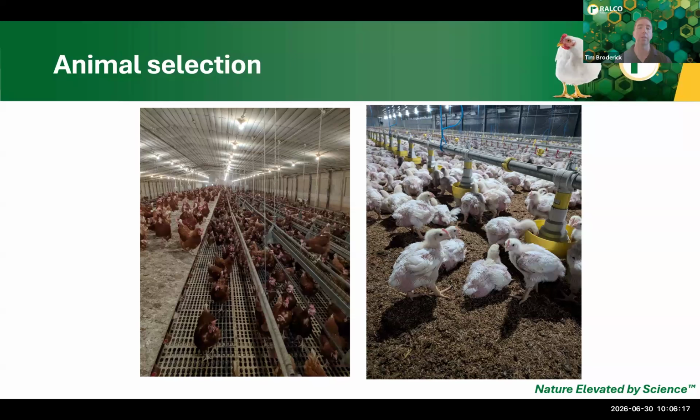First, we want to make sure that we get an appropriate sample, which is a fairly small sample size in all things considered within poultry operations. And it does depend on whether or not you're looking for a specific disease challenge or just doing maintenance. This can be as little as one bird sampled for every 3,000 birds in the house. For basic baseline checks, you can go as little as just 5 birds and still get a fairly representative selection.